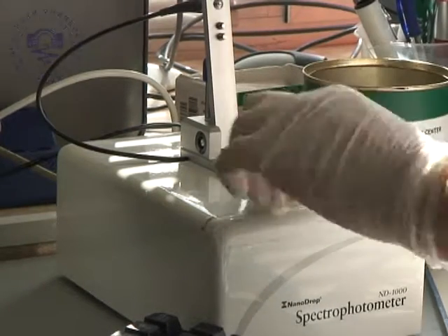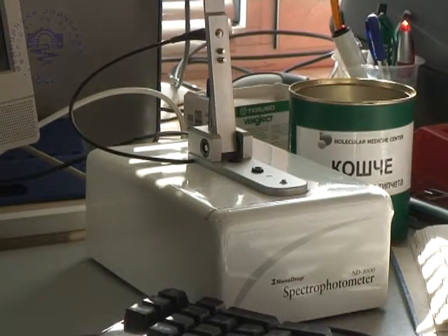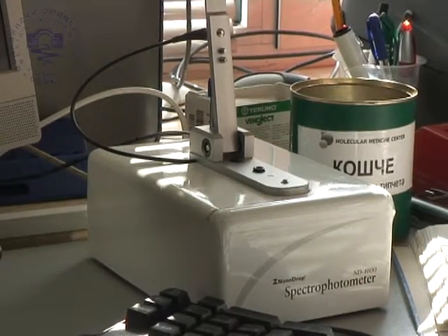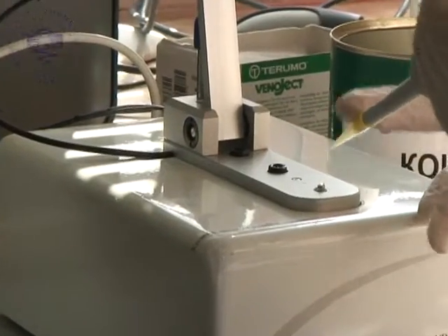The measurement surface is cleaned after each measurement. The device can measure highly concentrated samples without dilution. The sensitivity range for DNA detection is between 2 and 3,700 nanograms per microliter.